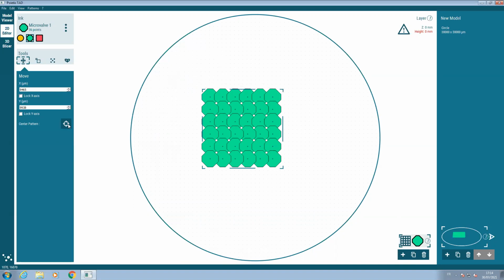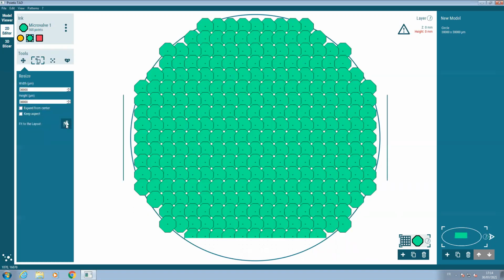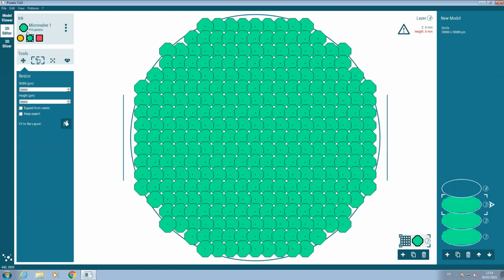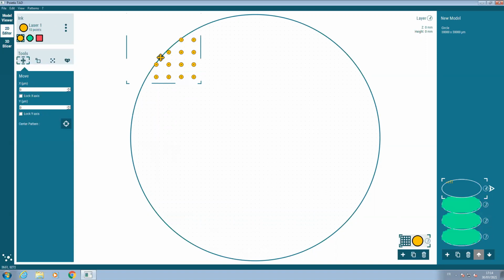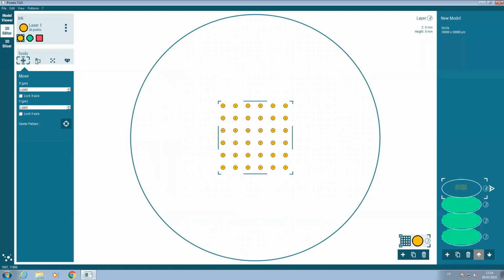So here I can center it. I adjust it. And then, of course, you can repeat the layers. Now I will add the layer of fibroblast. So here, fibroblast. Again, what you print is droplets with the laser. You can center the pattern.